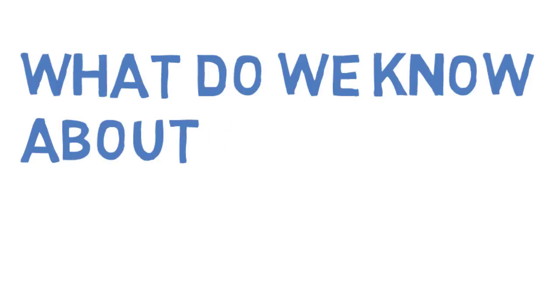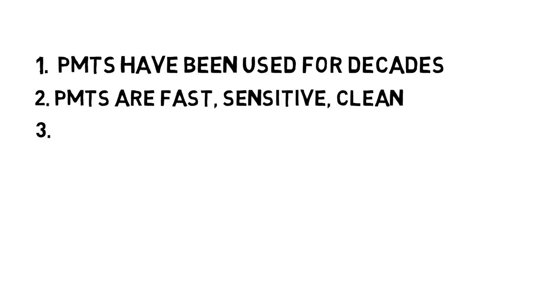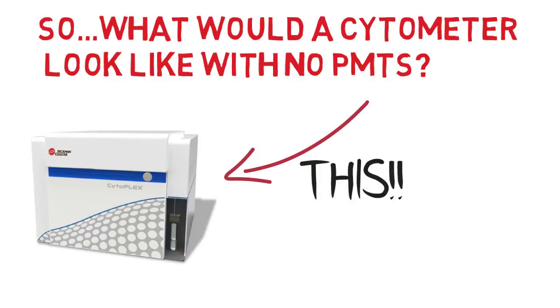What do we know about detectors in cytometry? PMTs have been used for decades. PMTs are fast, sensitive and clean. Virtually all flow cytometers use PMTs. So what would a cytometer look like with no PMTs? None. Zip. Nada. No PMTs.